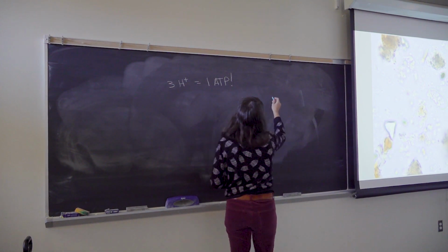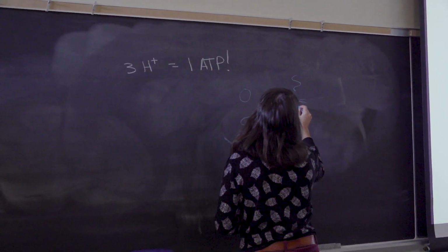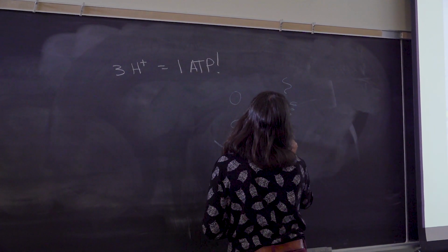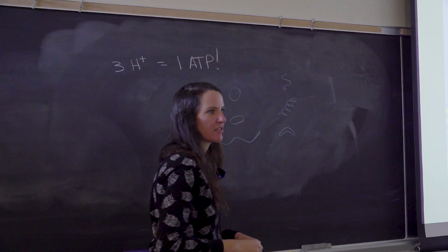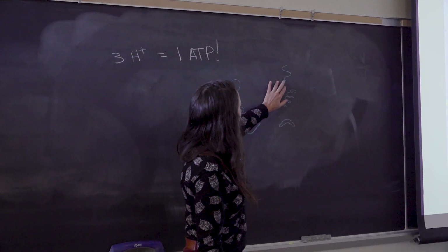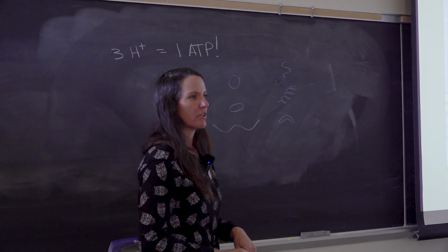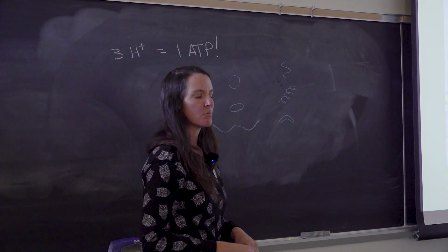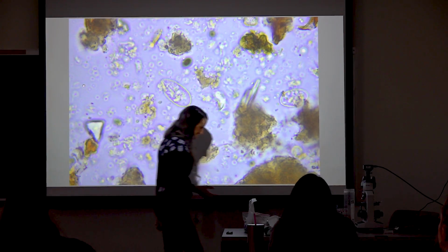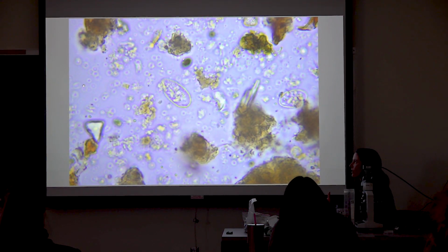And then there are certain shapes that are not great bacteria. Spirochetes, Spirilla, Vibrio, things like this are typically going to be pathogens. We don't want to see high numbers of those. These spiral type bacteria I see a lot in manures and things like that. It's a reason you want to really get your temperatures up. Some of those can even be human pathogens. So when we're performing microscopy, we're looking at morphology, which is the shape of these organisms.